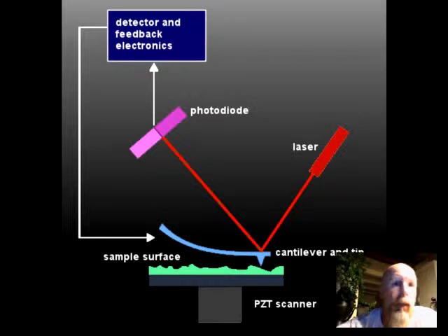The AFM can be used to image and manipulate atoms and structures on a variety of surfaces by sensing individual atoms on the surface. The tip of the probe forms an incipient chemical bond with each atom that subtly alters the cantilever's vibration frequency. This allows different atoms to be distinguished as well as mapped.